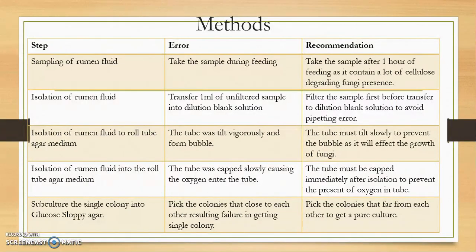In order to make sure that we don't pick the same colony, we must pick colonies that are far from each other in order to get a pure culture.